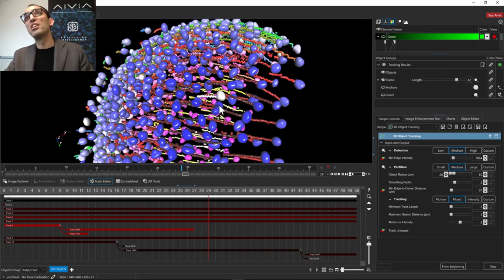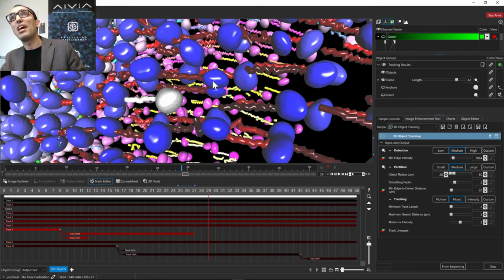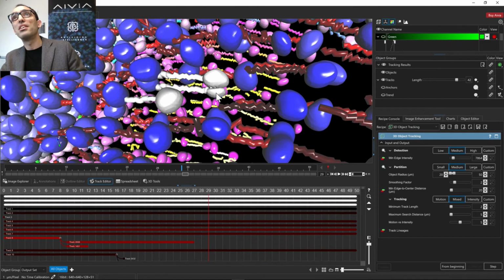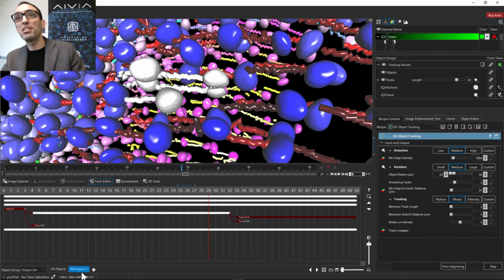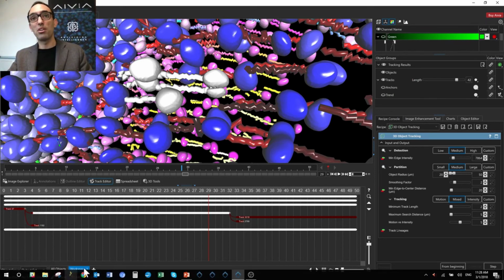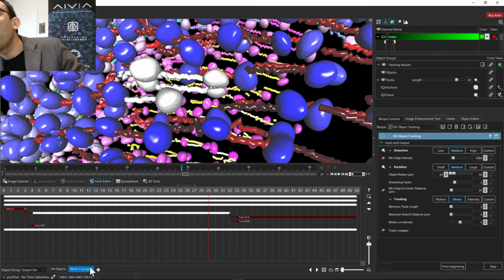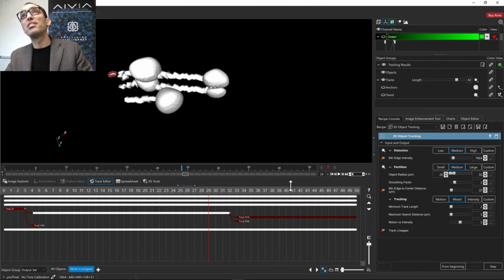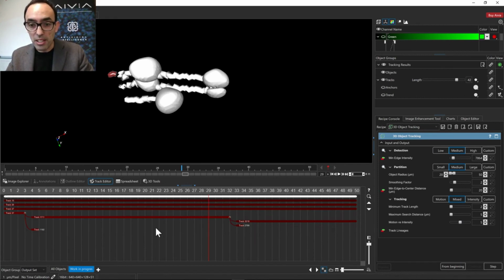So the editing itself, there's a few pipelines that we found people have. Either they do it regionally, so they would go in and say, okay, I want to edit these objects that are in this area here. So I want to do these guys, maybe all of those. Then you change this to a different workspace. I now have these few tracks in workspace 1, which I can rename work in progress. Did I type that right? Yeah, good. And I can also hide all the others. So in this mode, I just show the ones that are in this particular workspace. And I can now go in and do all my editing.